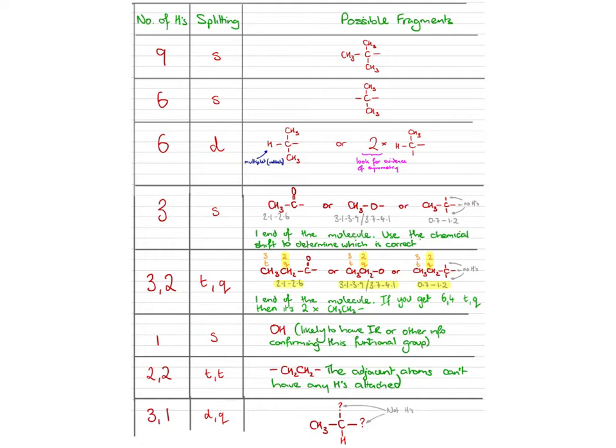But anyway, I would absolutely make your own copy of this table, and whilst you're getting used to NMR, I would use it. But of course, you're not going to have this in the real exam. So at some point, you have to put it away, and you just have to have grasped those certain patterns and look for those certain things. Always look for your triplet quartet. Always look for a singlet with 3 hydrogens. Always look for a singlet with 9 hydrogens. If you see those initially, you will have identified a large chunk of the structure, and then it's a question of filling in the gaps.